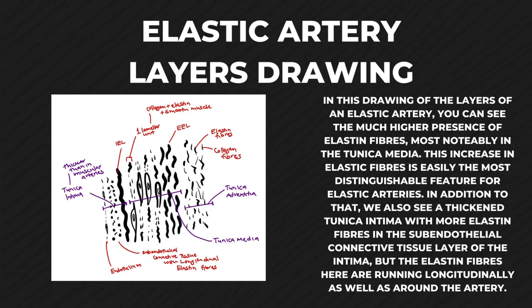In addition to that, we also see a thickened tunica intima with more elastin fibers in the subendothelial connective tissue layer of the intima. The elastin fibers here are running longitudinally as well as around the artery.